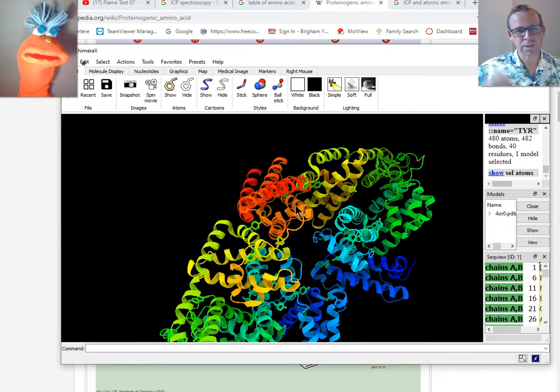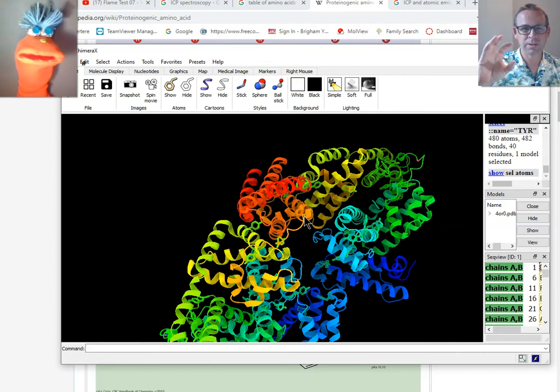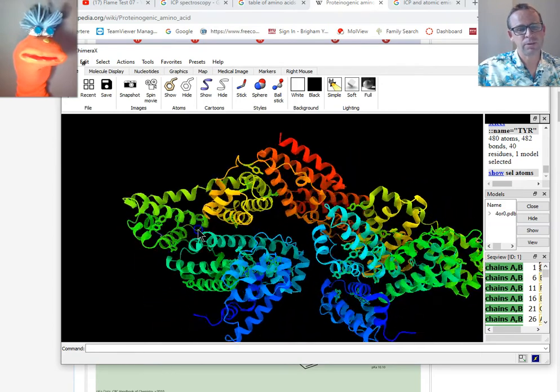protein's structure. Because, like we said, if the tryptophan is buried, it'll fluoresce differently. So if the protein moves, the fluorescence will change because of the availability of the tryptophans, right? Does that make sense? Yeah. Now, there's something else involved as well, though.